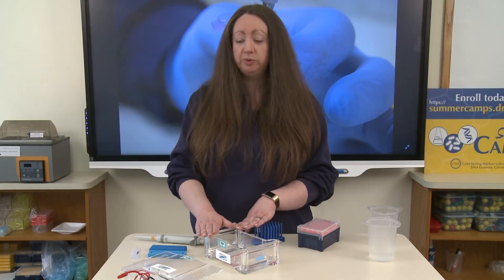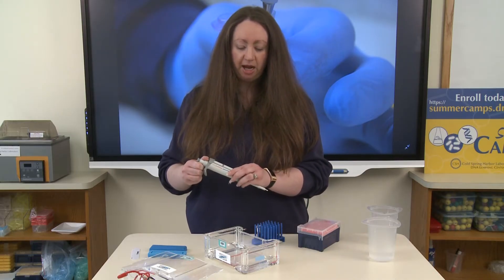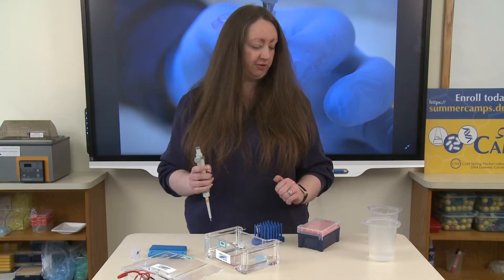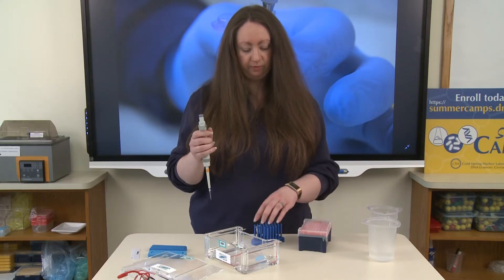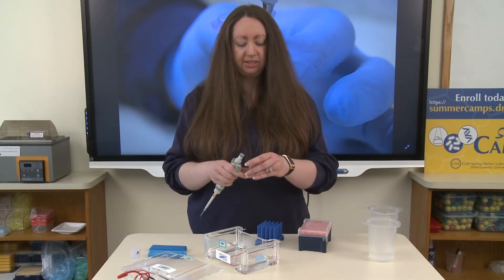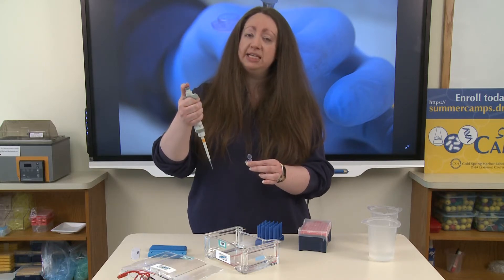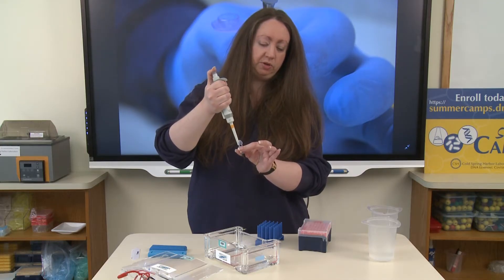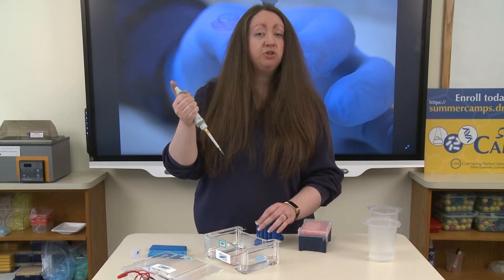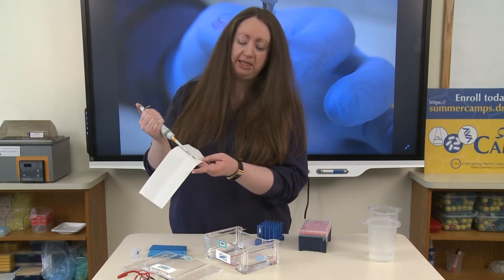So now our gel is set up and we're going to load our samples. I'm going to load 10 microliters of my loading dye here into my first well. Of course, as always, to make sure we don't cross-contaminate, we need to place a tip on our pipette. I'm going to draw up 10 microliters of the loading dye. Be very careful if you're using loading dye — it's not necessarily toxic, but it can stain.